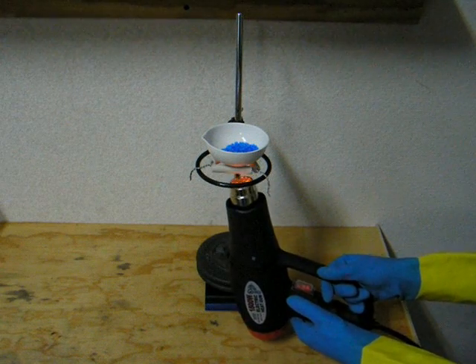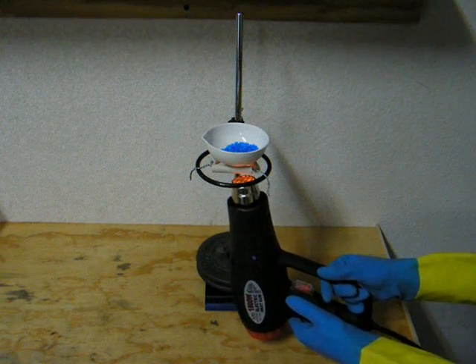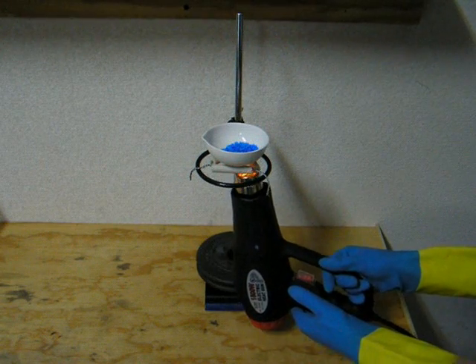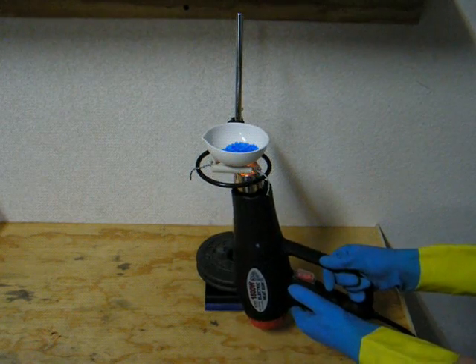Halfway through heating, I transfer the contents of the crucible to a mortar and pestle, crush it, return it to the crucible, and continue to heat. Crushing the copper sulfate increases its surface area and ensures that all of it is converted to the anhydrous form.